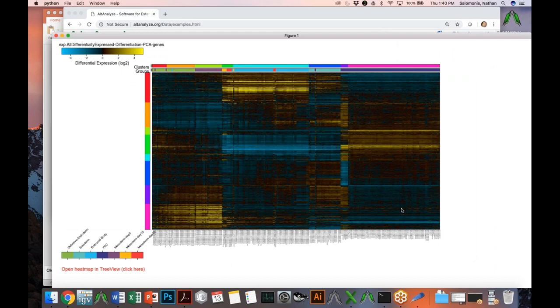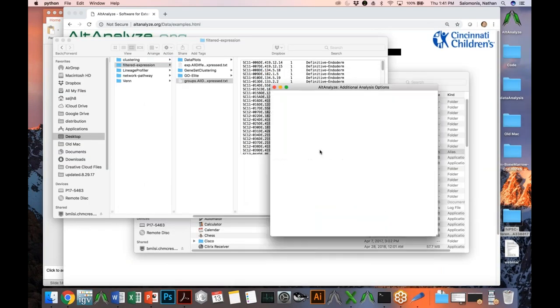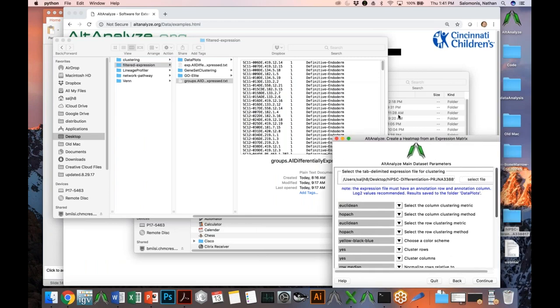Here are the new genes defined by the principal component analysis. As you can see, these genes are largely clustering the samples based on their known lineage. Mesoderm day five samples cluster out separately along with definitive endoderm samples. Definitive endoderm gene expression is higher for one cluster versus mesoderm expression in another, though there's a gradient of similarity. The embryoid body samples largely cluster together and the pluripotent stem cells again cluster together as expected. This analysis is a nice way to understand the major biology.